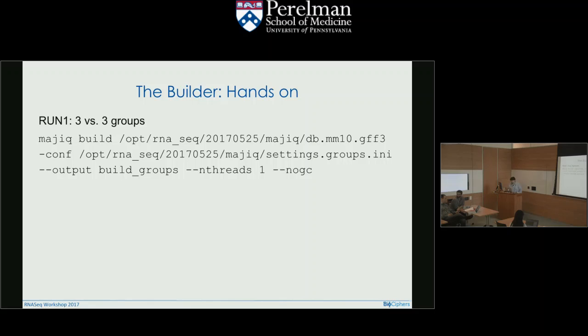But if I have my own machine, I should use higher numbers, right? Totally, yeah. And it will not distinguish between threads within nodes and the different nodes. Right now it's thought to be run in a single node, so you can run up to 16, 32 threads in the same node. If I have a thread number bigger than the cores supported, then it will find another core.